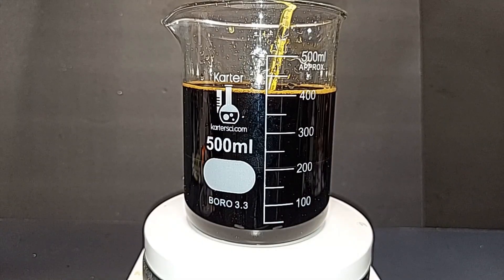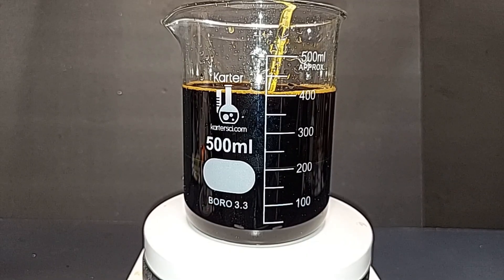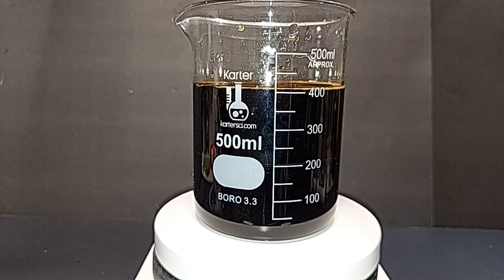Here's our ferric chloride solution. The temperature only got up to about 36°C and is already coming down — no problem with the temperature at all. I'll let it mix for another 10–15 minutes. A majority of this I'll try to crystallize into solid ferric chloride; I'll let it mix for about 10 minutes, then turn off the stirrer.